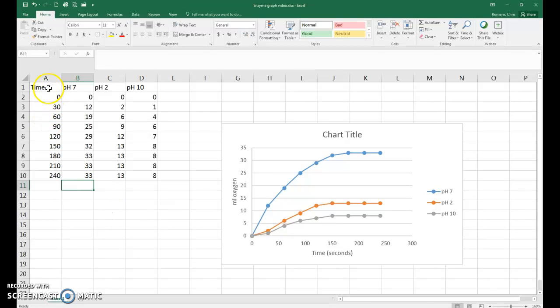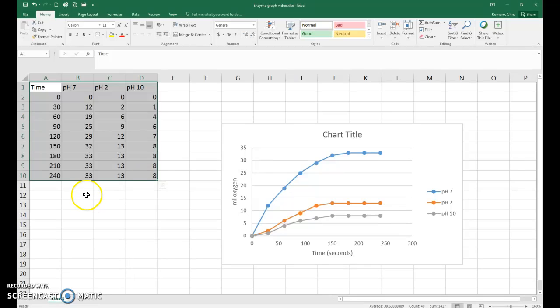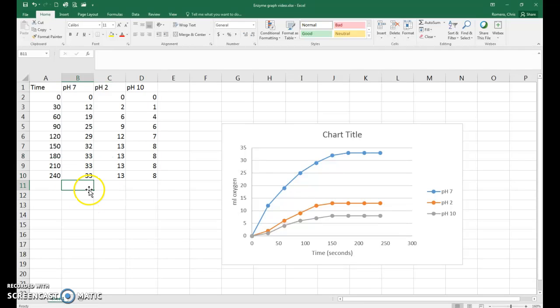Notice I've got all my data entered in, just like in the graphing video. So what you're going to want to do first is click your mouse on an empty cell underneath the column of data that you want to calculate the slope for.